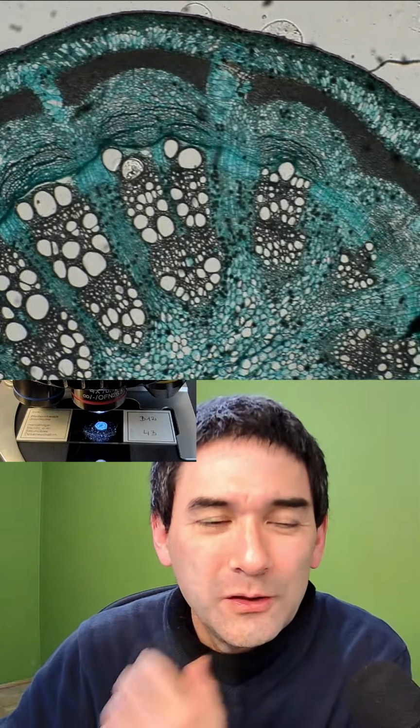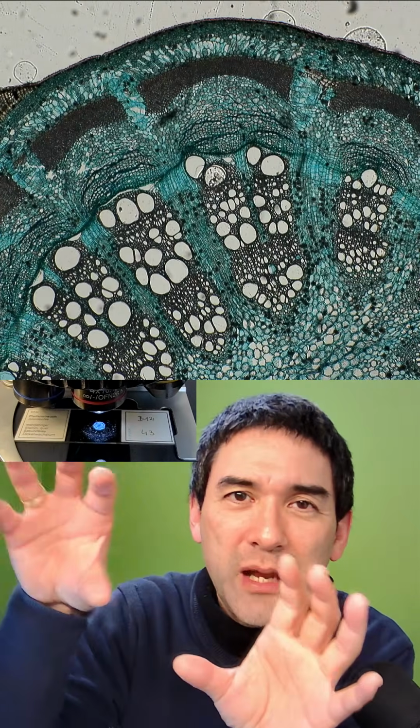Here you can also see again this ring-shaped arrangement of the vascular tissues, which is so typical of a dicot plant. The largest cells, again, are the xylem for transporting the water.